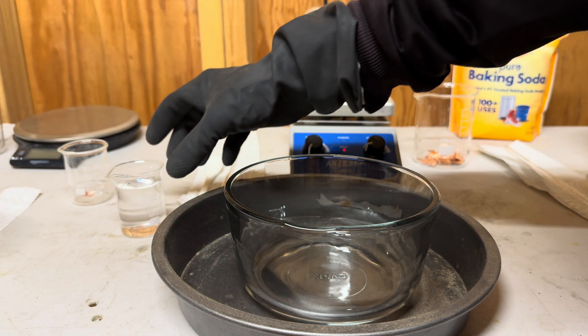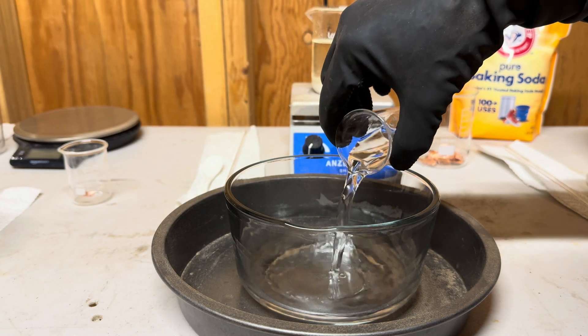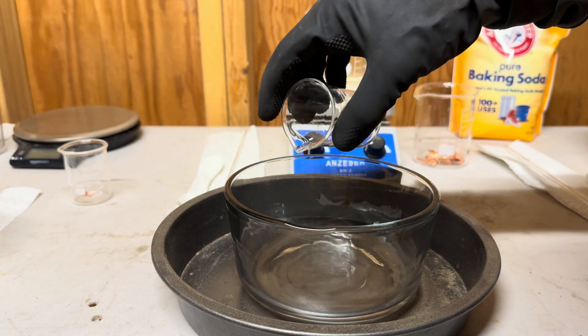Take 50 milliliters of distilled water and pour it into the larger container, then place the acid mixture container inside the larger container.